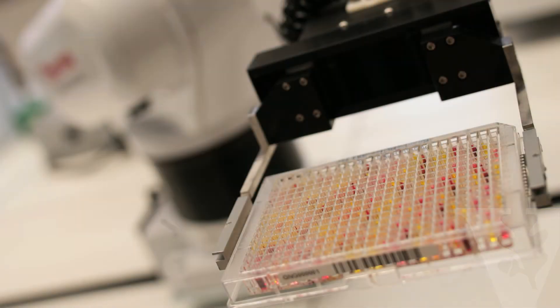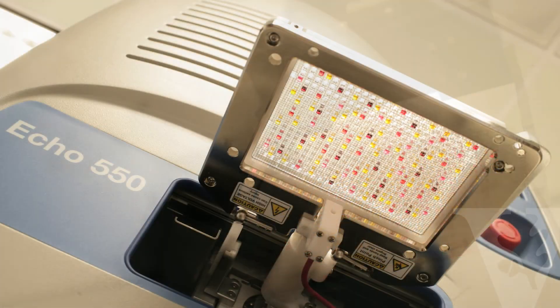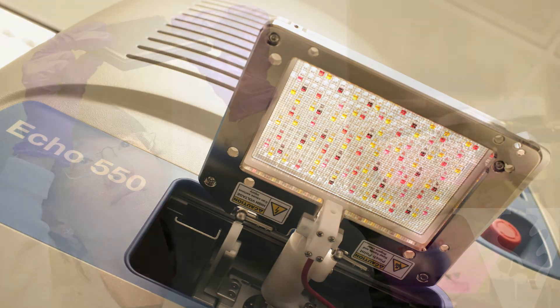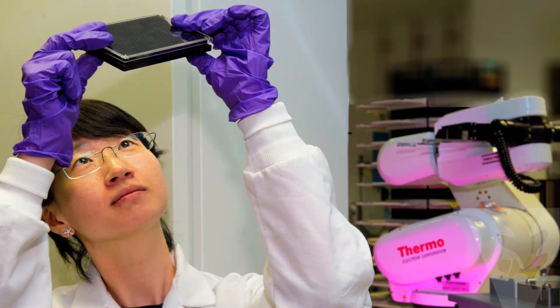The Vanderbilt High-Throughput Screening Corps facility provides an array of services ranging from independent instrument use to full-scale high-throughput screening to both Vanderbilt and external investigators.